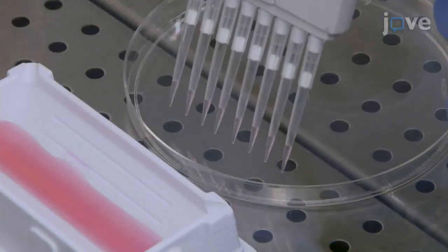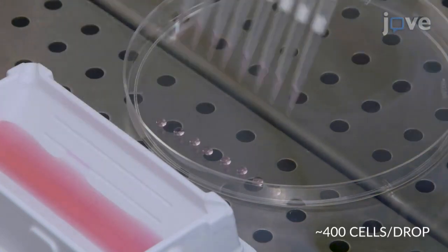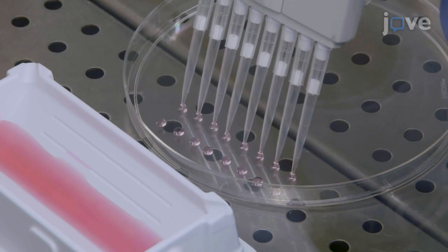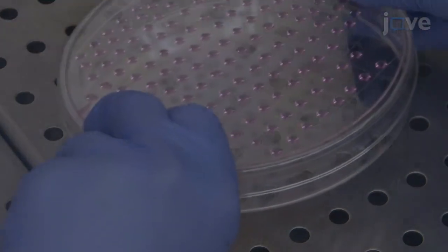Invert the lid of a 15 centimeter culture dish. Using a 200 microliter multi-channel pipette, deposit 20 microliter drops of resuspended cells on the lid. Invert the lid carefully and place it onto the bottom portion of the culture dish.